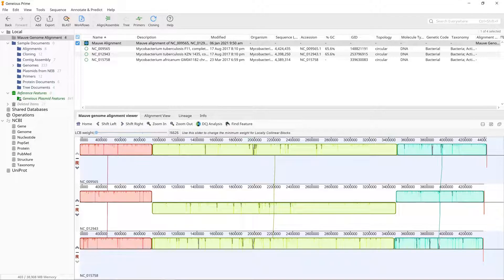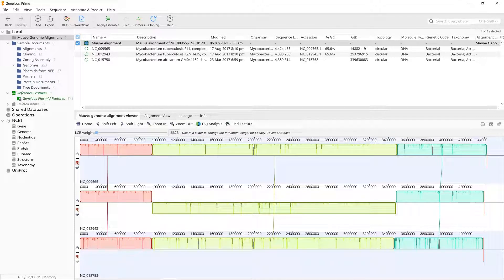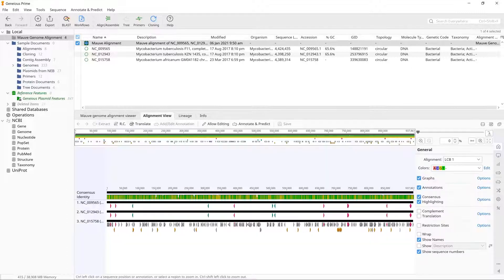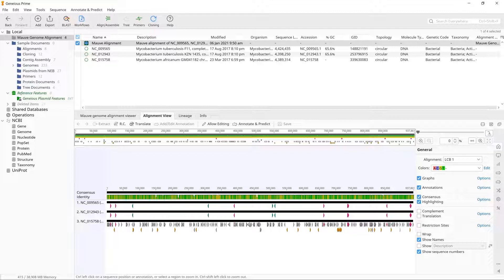To view the aligned sequences in a view that looks similar to the regular Genius alignment viewer, click the alignment view tab above the sequence viewer. This displays the alignment for one LCB at a time.